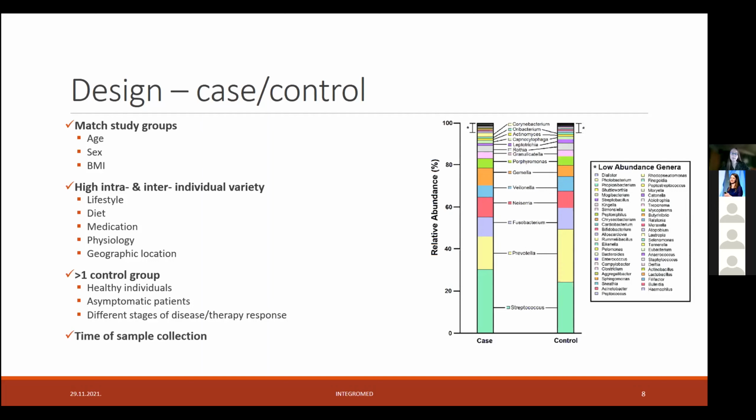And also time of sample collection can be crucial because there have been some studies showing that microbiome can be affected by circadian rhythm, so time during the day. And moreover, if we are talking about seasonal effect in countries where it's more pronounced, then that could affect your results significantly. For example, in Latvia, during summer, we would eat a lot of strawberries. I don't know, during June, a lot of cheese and beer. And if you look at December, then we know it's time for some citrus fruits, gingerbread, and other Christmassy foods.